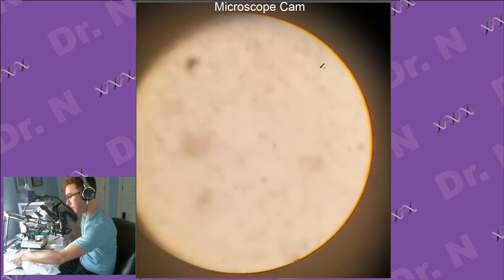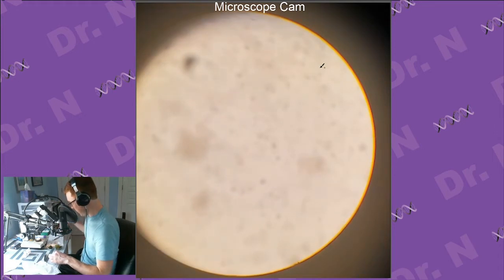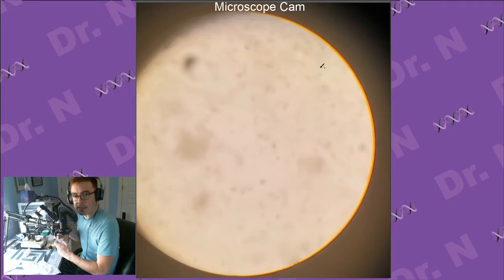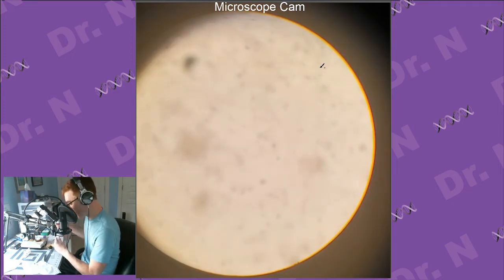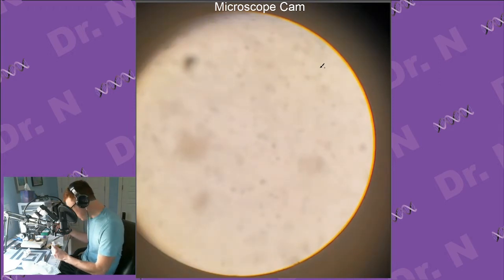All right, so I will rehydrate this lichen. I'm curious if there's anything living on the lichen itself, but it's kind of dry. I found it on my deck, so I'm just going to let that sit for a little bit. And then I'll wash off some of this moss that I have and pick up the liquid, and then we'll see if there's anything on it.